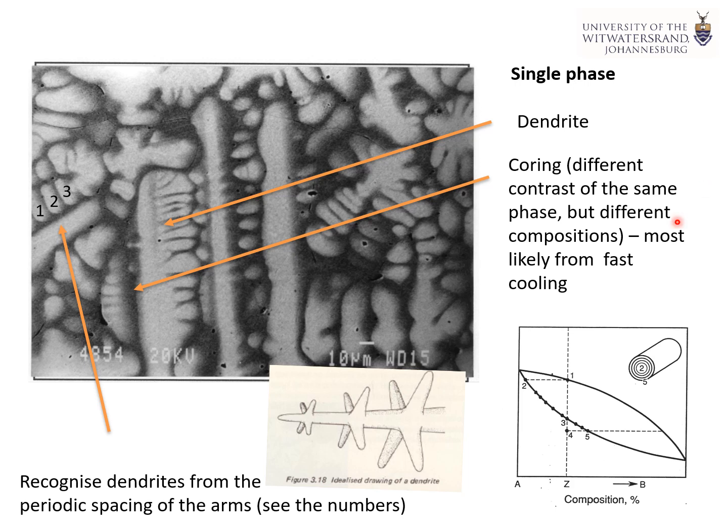And what's going on in this example is, although it's single phase, it looks different. And what's happening with that is because you've got a wide gap between the liquidus and the solidus, and quite a long composition range. And the liquid runs down the liquidus, and the solid runs down the solidus.